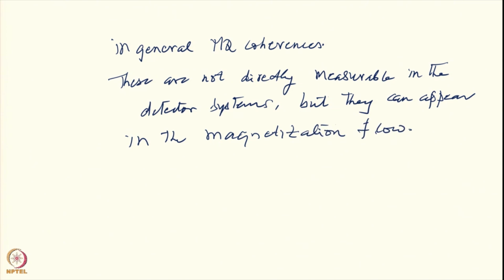Okay. So, when you are having multiple experiments, various kinds of transfers at various places, all these kinds of terms will appear. We are going to use this in all these multidimensional NMR experiments which we will discuss, the various kinds of correlation experiments which I mentioned to you. They will come across all of these kinds of terms, and therefore it is important to understand what we are talking about here.